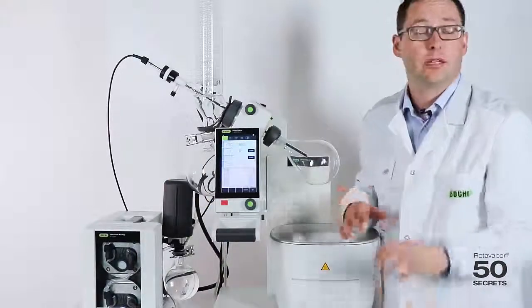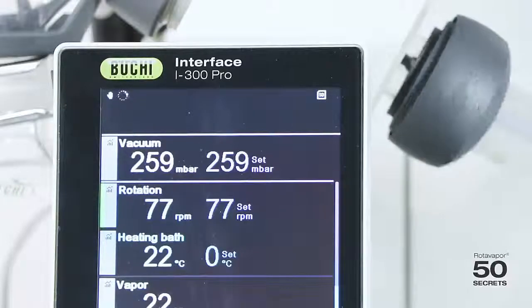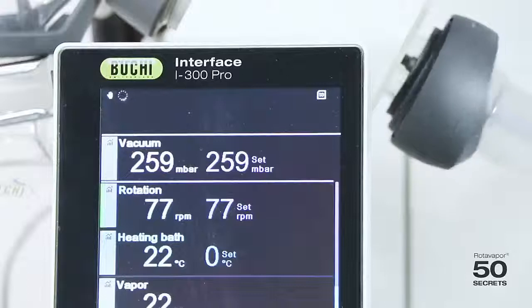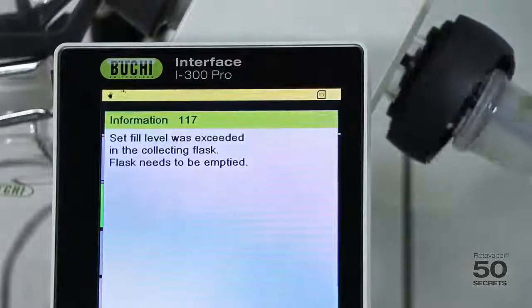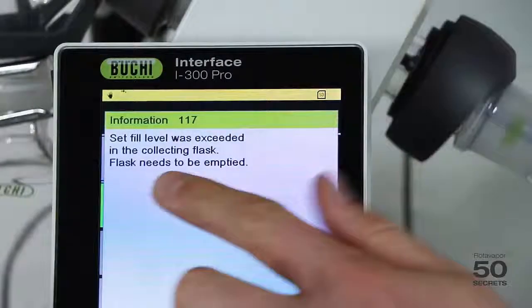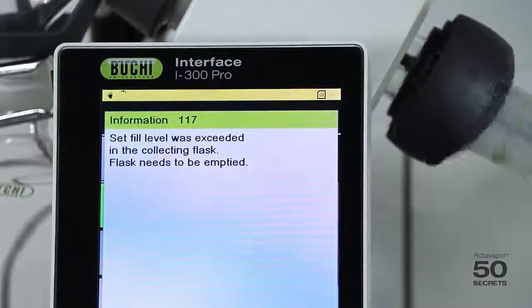Let me show you what happens when the level is reached. If the secondary flask gets full during the process, you will see a message on the interface screen. The distillation will not stop — it will just inform the user that the fill level is exceeded and you have to empty the flask.